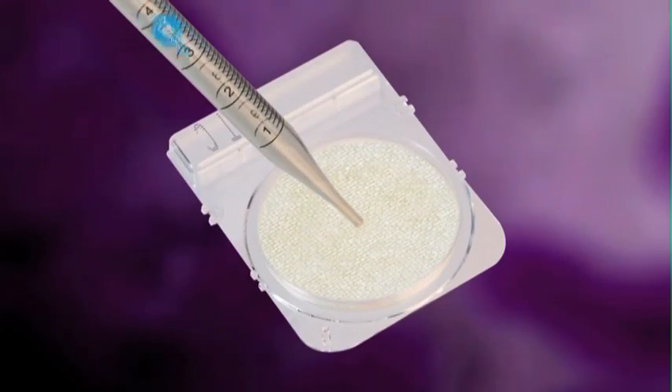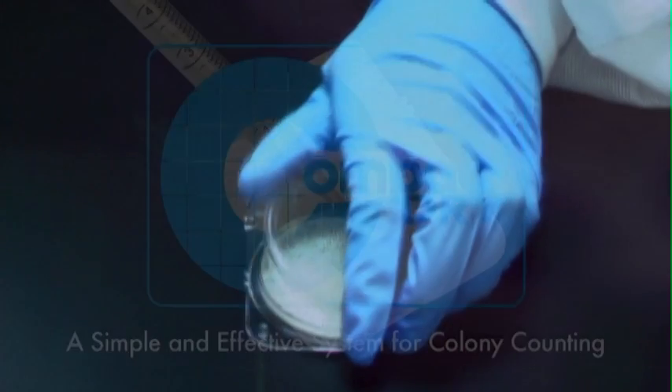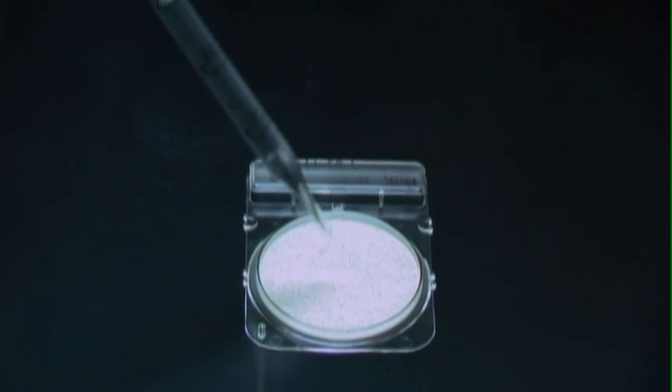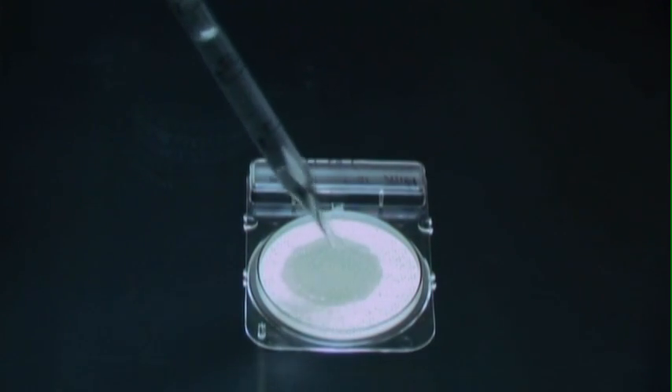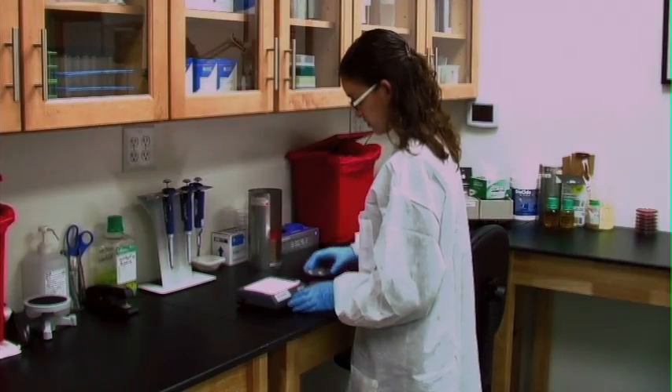EnviroTrans is compatible with Compaq Dry for environmental colony counting. Simply place 1 ml of the sample onto the Compaq Dry plate, incubate, then read.